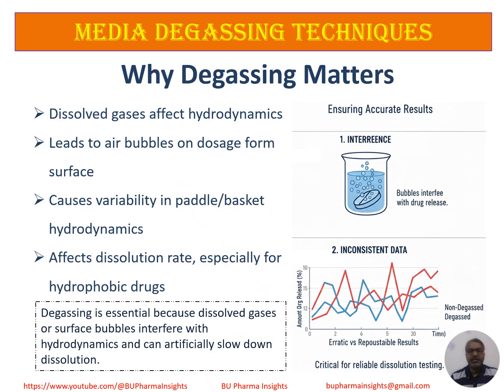Degassing is essential because dissolved gases and surface air bubbles interfere with dissolution hydrodynamics. Air bubbles can reduce wetting, disturb sink conditions, and alter flow properties around the dosage form. They may stick to the tablet or capsule surface, creating a barrier to dissolution.